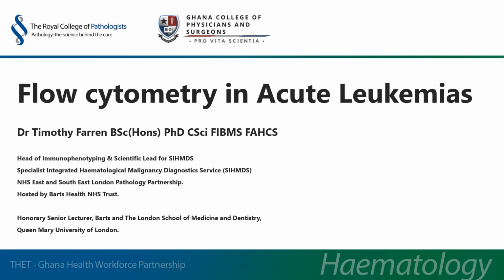I appreciate that many of you will have varying levels of expertise in flow cytometry, with some having more experience than others. As such, I thought it would be best to split this presentation into two halves. As I'm sure you can appreciate, it's quite a big task to try and accommodate both flow cytometry and acute leukemias into a lecture. So firstly, I will present on the basic principles of flow cytometry and basic plot interpretation. Then the second half will focus on the clinical applications and, where possible, with any correlation for morphological review.